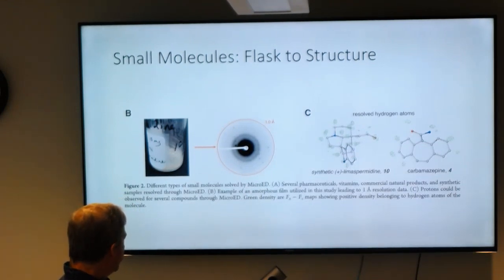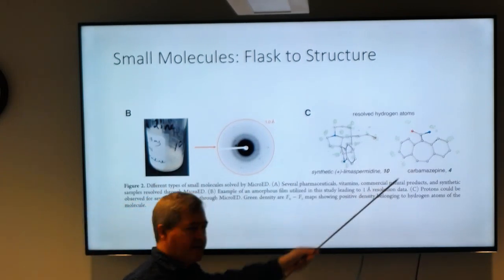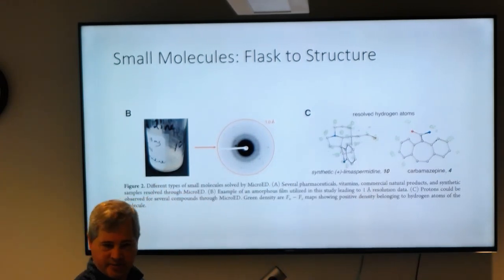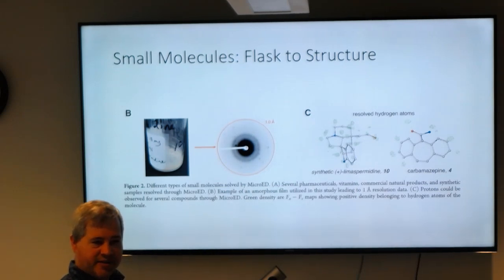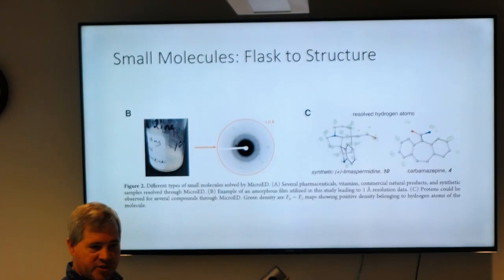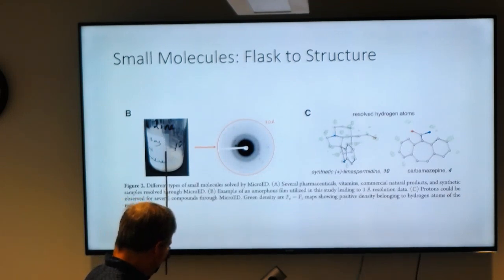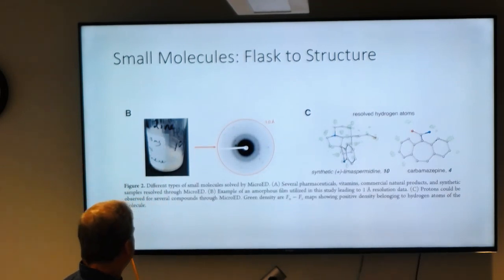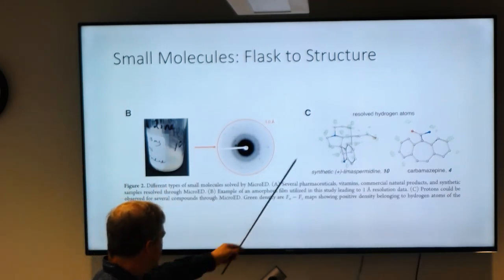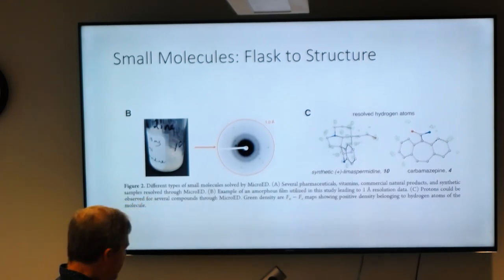So they're quite excited by the fact that we can go from this to this in a very short amount of time, using the microscope on site, not having to redissolve this and try to grow a crystal of it and then do X-ray diffraction, but just go from the purified or synthesized molecule to structure and see what it is.